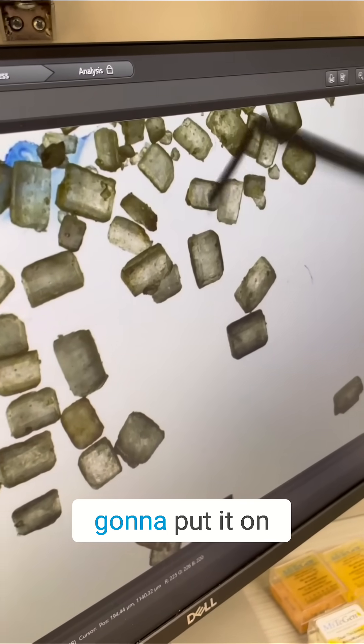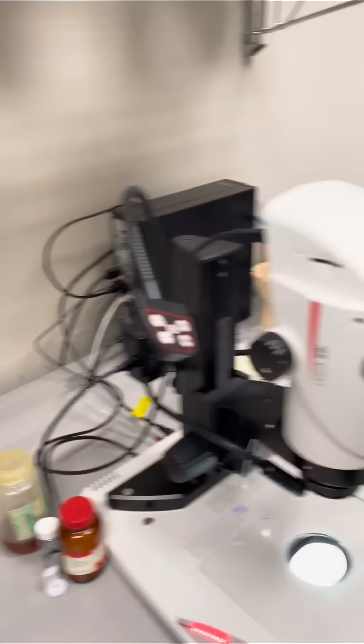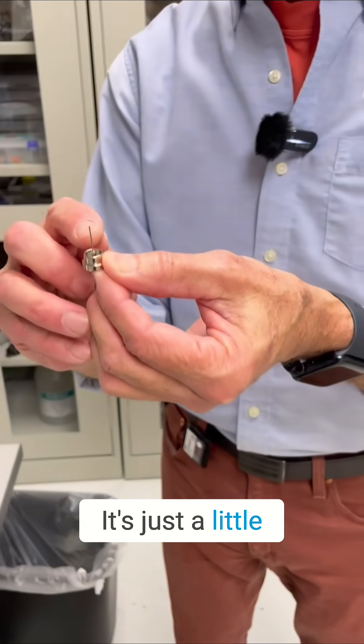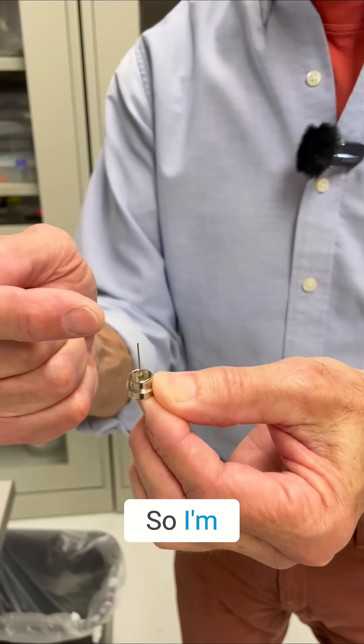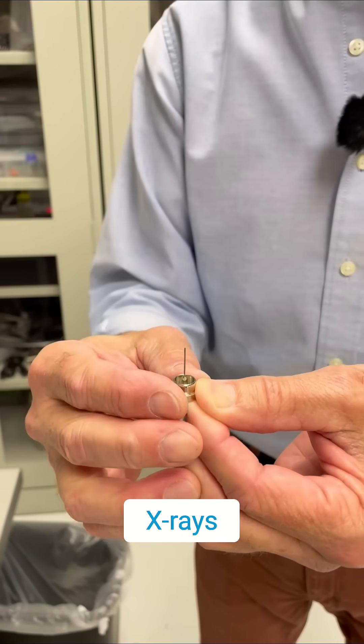Well, I'm going to pick one out and put it on a little crystal holder. Okay. And I'll show you what that looks like. It's just a little tiny mount with a little nylon loop in there. So I've stuck a crystal on there and we're going to go shoot x-rays at it.